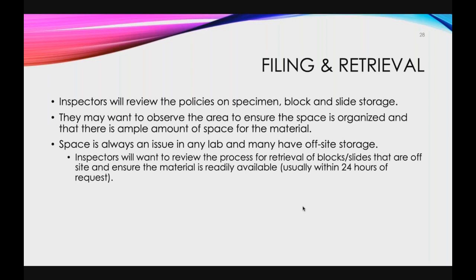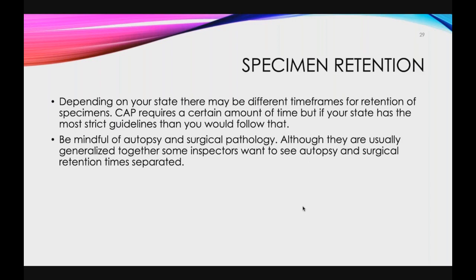We use an off-site facility. We also have another part of the hospital that they use for storage. Depending on how much, we used to be able to keep 5 years on site. Now we can only keep about 2 years on site. So we've grown, and our filing and retrieval has also grown.